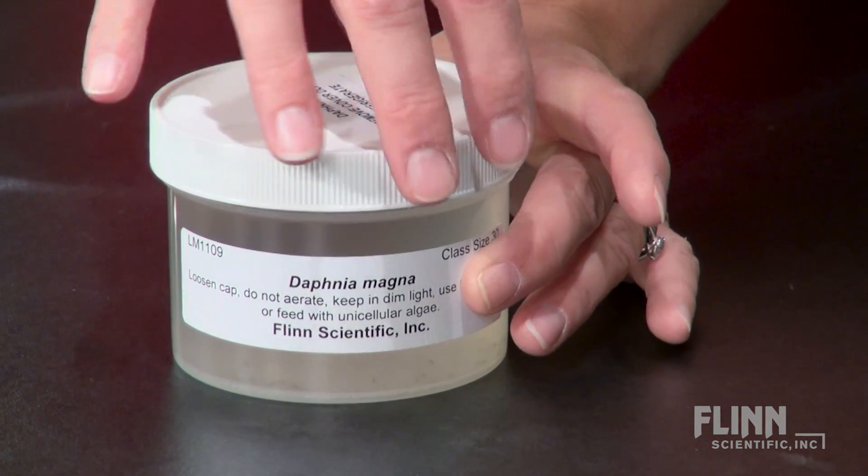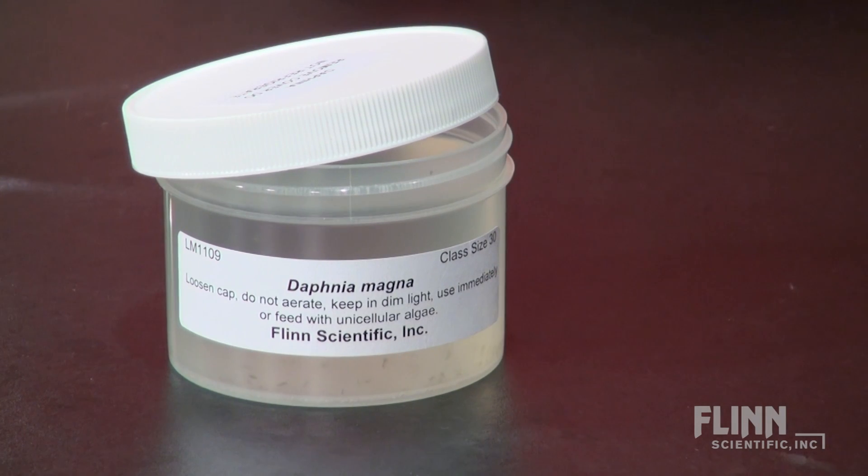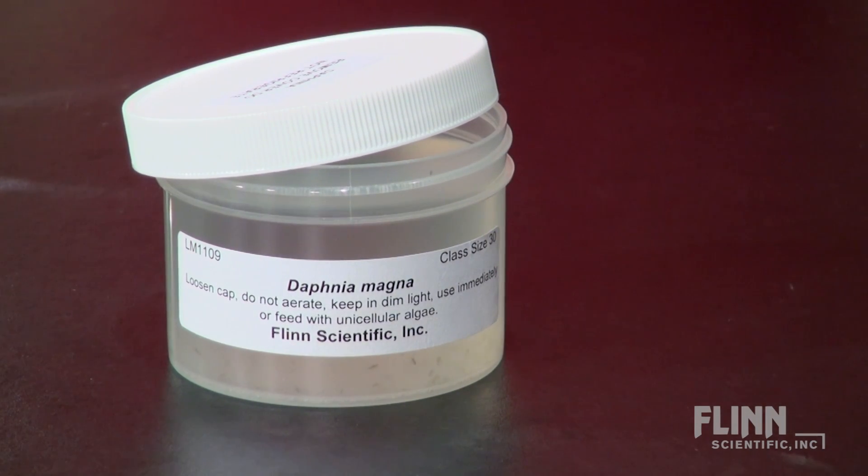When you receive your Daphnia, open the lid of the jar and rest the cap on top. Do not aerate, as air will become lodged under the carapace, pushing the Daphnia to the surface and killing them.